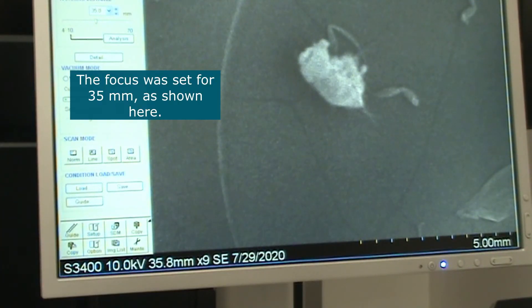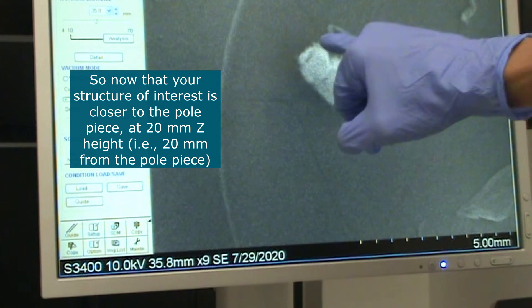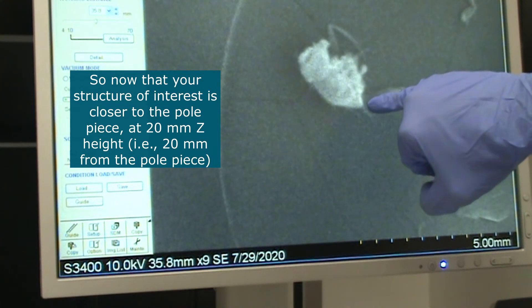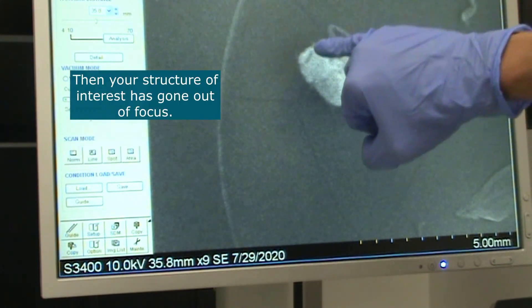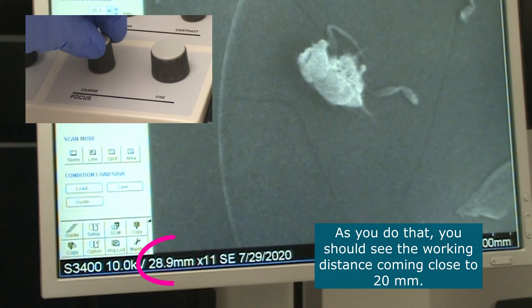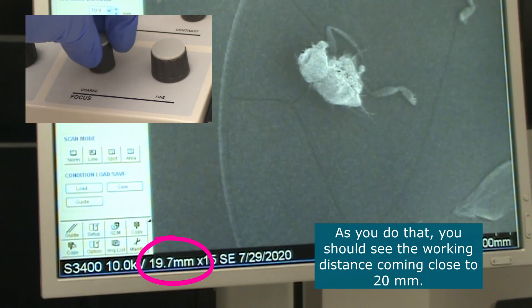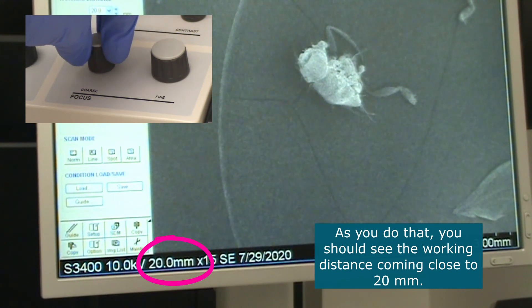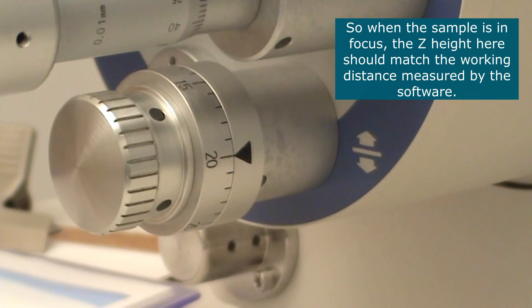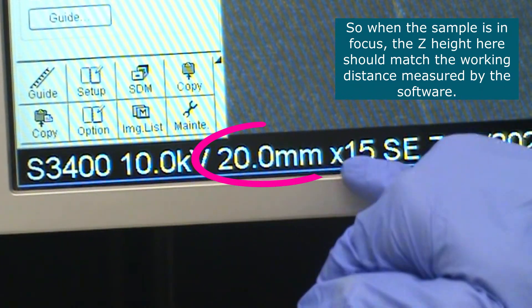The focus was set for 35 millimeters. Now that the structure of interest is closer to the pole piece — at 20 millimeters — it has gone out of focus, so you need to use the focus controls again to bring it back into focus. As you do that, the working distance should ideally be close to 20 millimeters. When the sample is in focus, the Z distance displayed should match the working distance indicated in the software.